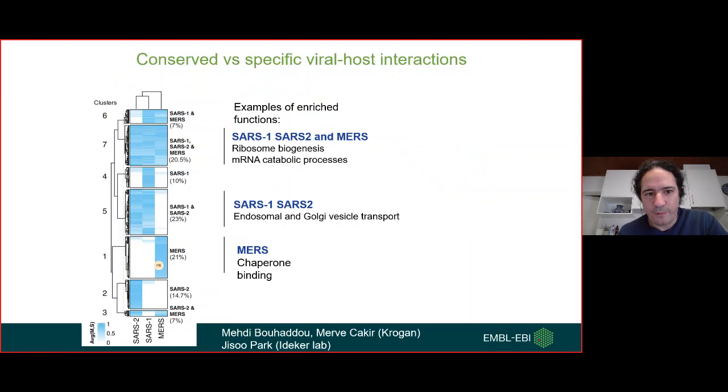So finally, we could directly look at the interactions between the three and suggest which are the most conserved processes and which looked least conserved. As you know from mass spectrometry, looking at differences is always tricky because you may not see a protein, so it's always harder to quantify the difference. If you're interested in that, the paper goes into trying to quantify the difference, even the presence or absence of information. So it's easier to say something about what's conserved. Here are some examples of processes that are conserved, meaning protein interactions are conserved across the three.